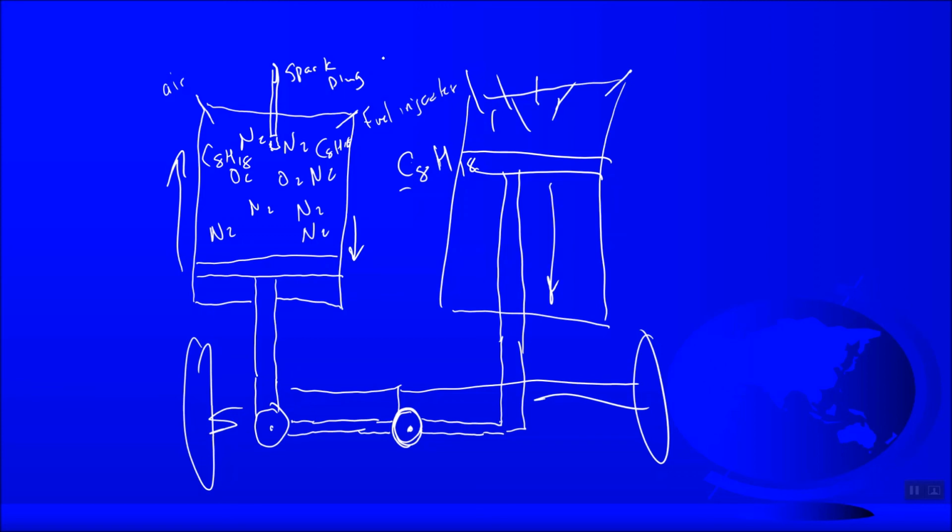So the spark plug, in our demonstration, was played by a Tesla coil. The air was already in the bottle. The fuel injector, that's when I supplied alcohol in the form of a liquid. Because it is an injector, it automatically goes in as a gas, and you don't have to swirl the cylinder in order for it to become a gas. So you have the fuel plus oxygen. What forms? Carbon dioxide and water, and there is a way for those to escape, and that goes out your tailpipe in the form of gases.